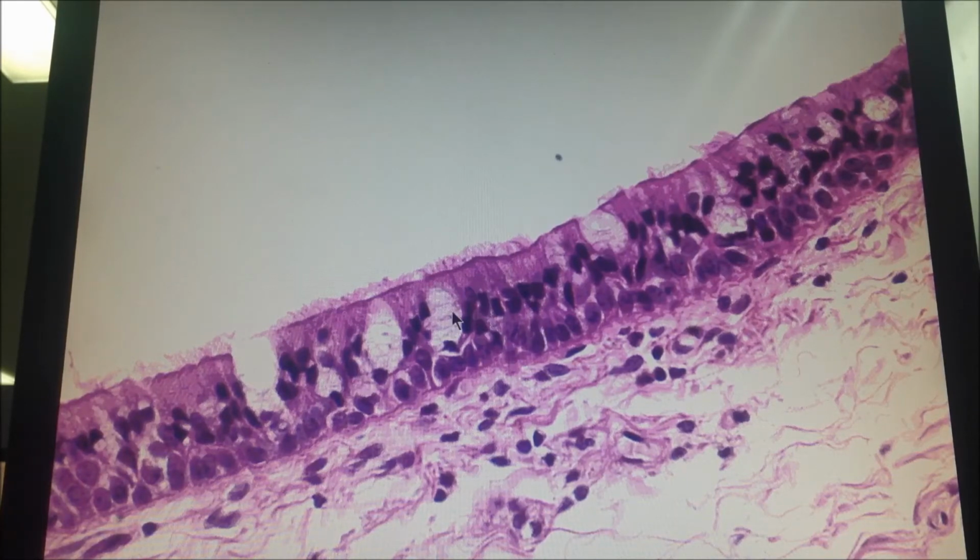بس احنا حكينا لكم last time there is no way to see goblet cells and cilia in a stratified epithelium. So this is obviously a pseudostratified ciliated columnar. This epithelium is found in the respiratory tract. Below the epithelium over here، دائما تحت الepithelium we have connective tissue.